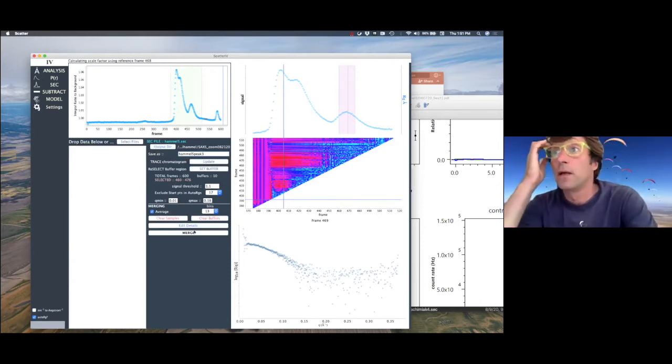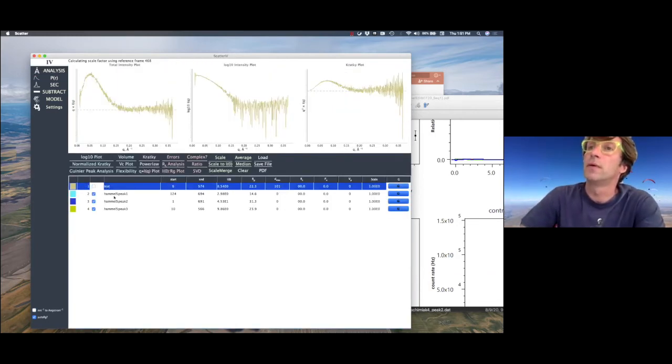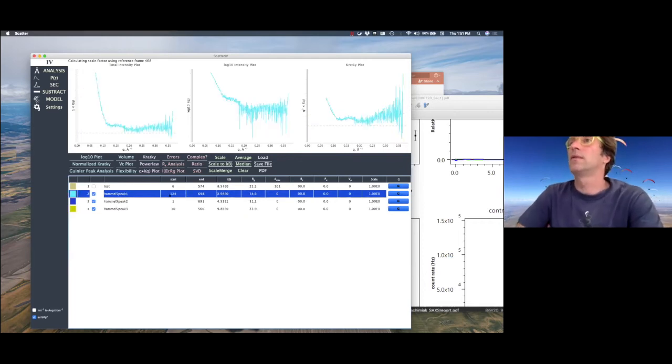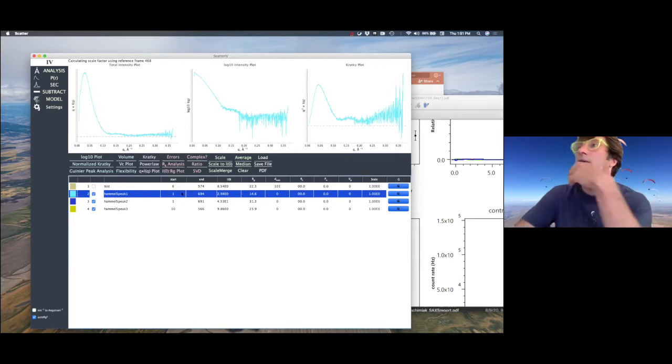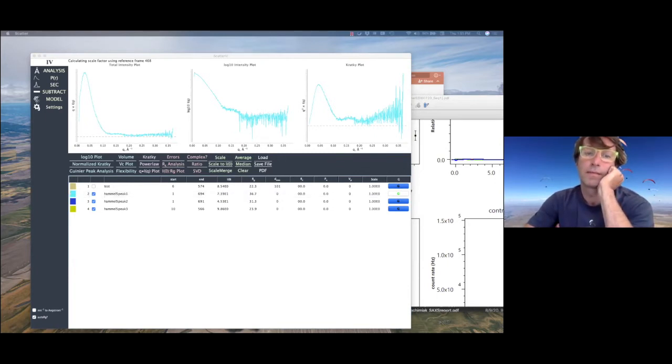Okay, so that's been done, and as you already know, sometimes the scheduler tries to tell you it's aggregated. Don't use the 120 points, forget that, ignore that, just go back and look at it.